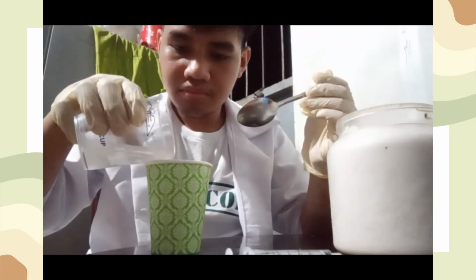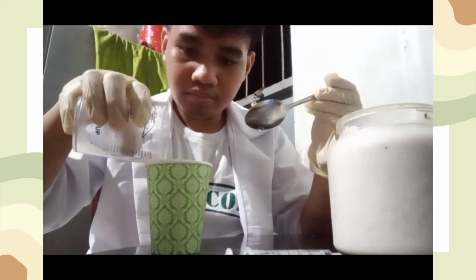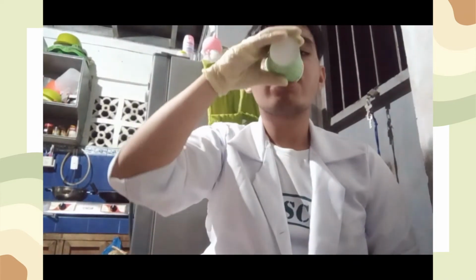And now it's done, we're gonna pour the salt water into the paper cup slowly. After stirring it, we're gonna drink a mouthful of the solution from the paper cup and swish it back and forth for at least 30 seconds, occasionally scraping your teeth along the inside of your cheeks as you do. It's best to do this with a clean mouth, not right after lunch.